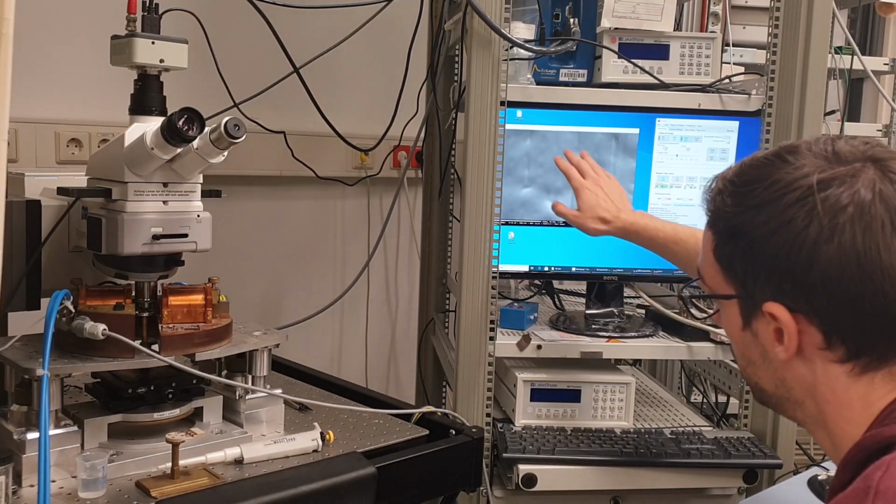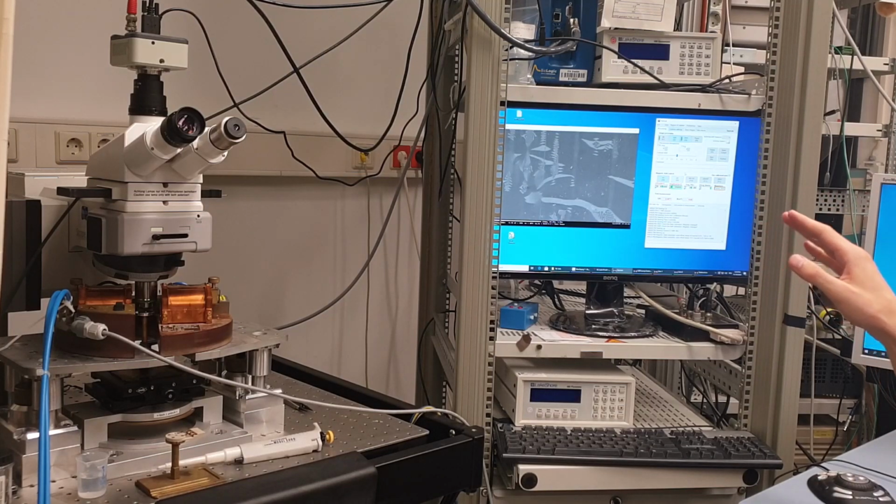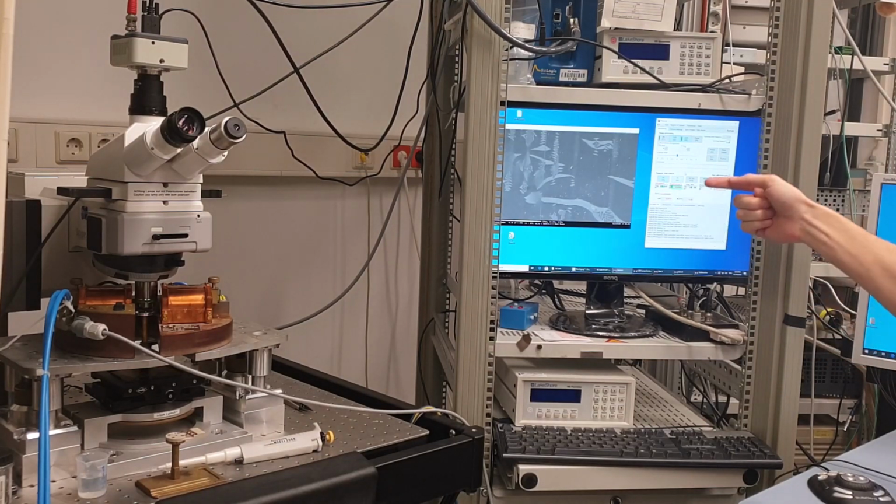What you see here is now the topography of the sample, and in order to visualize the magnetic microstructure, we first have to turn on the magnet. So what you hear now is the power supply of the magnet, and if we apply a magnetic field and use some digital help, we can visualize the magnetic microstructure. So these two colors indicate that the magnetization direction is in opposite direction. So for example, the black domains are magnetized in that direction, while the gray domains are magnetized in the opposite direction.